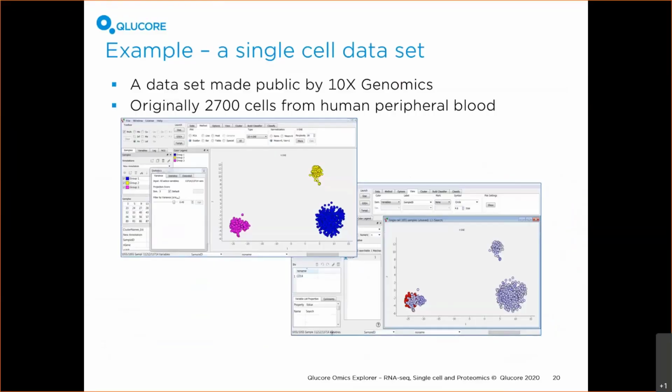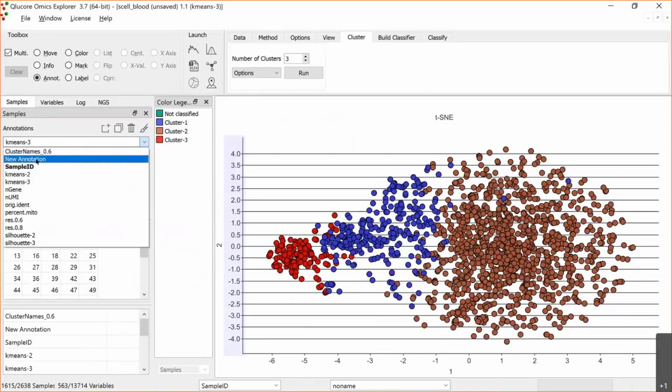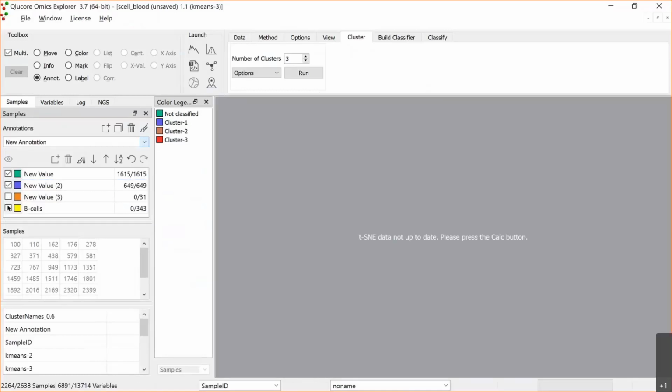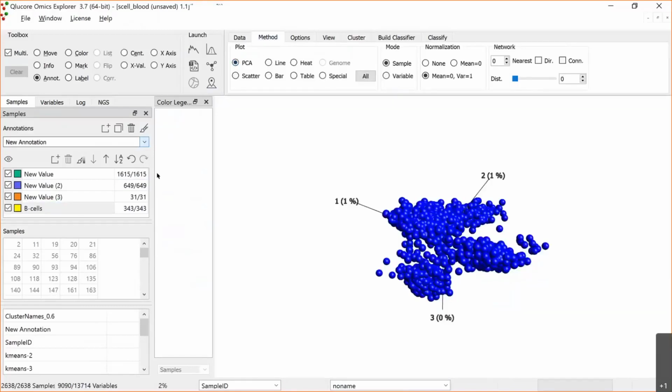So that's another way of identifying subgroups. Okay, now we will move back here and activate everything again. And I will change back to the PCA plot and color according to this here.